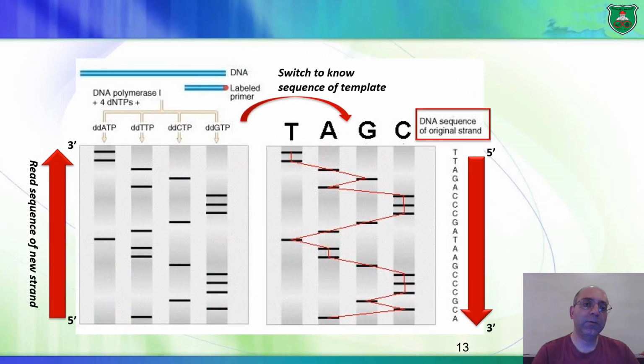Okay, so these are again different results. This is the gel done for the synthesized DNA. Here again we start from the bottom at the 5' end. So the sequence here is basically T, G, C, G, G, G, C, T, T, A, then we have T, then we have C, G, G, G, then T, C, T, then A, A.